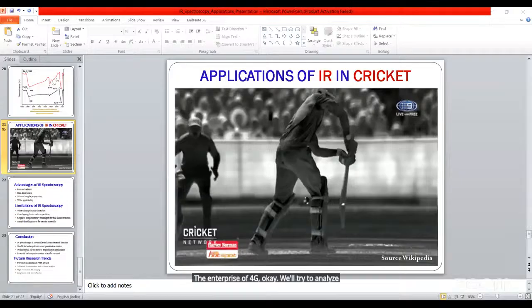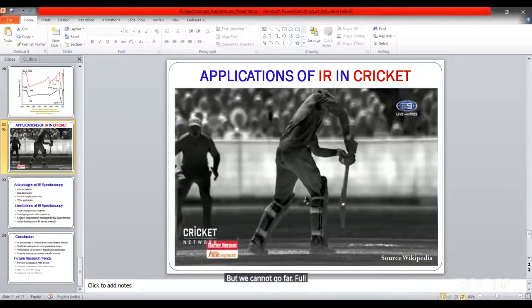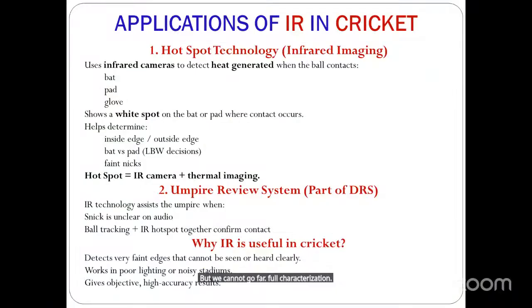I don't think the analysis by Origin will be covered in this session because already it is 11:30. Let's see what happens. At least I will show you the interface of Origin. Okay. And we'll try to analyze one spectrum, but we cannot go for full characterization, full IR characterization.